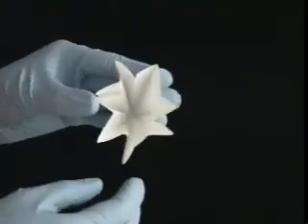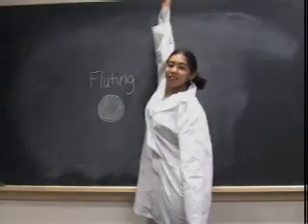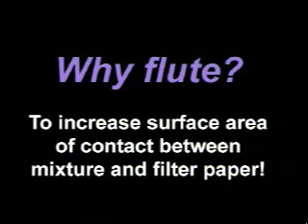By the end of this, all the folds should be alternating — this creates the fluted structure. You may be asking, why should we even bother to flute? Well, it increases the surface area of contact between the mixture and the filter paper, therefore creating a more efficient filtration.